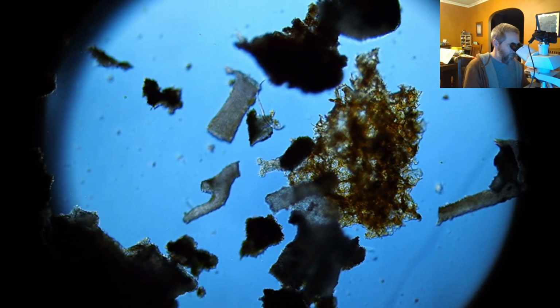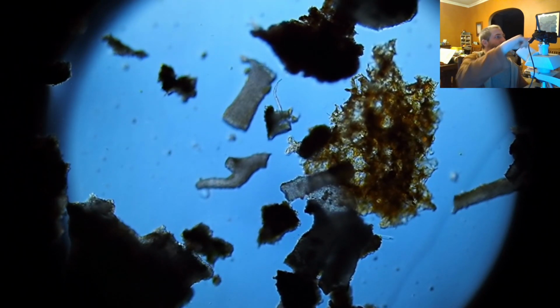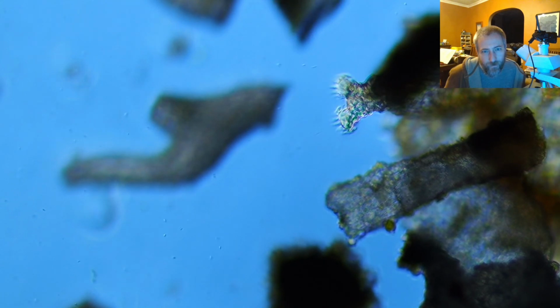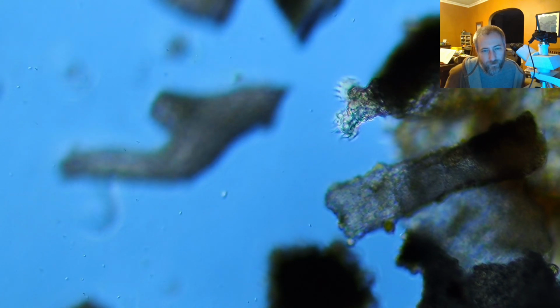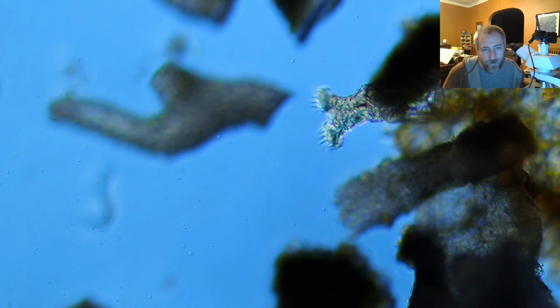Oh, there you can see it's got its corona out. Little cilia are spinning. Let me try to zoom in on that so you can get a good view of it, because those are really cool. You can see the little hairs associated with it. It can kind of pull them back inside of its mouth. You can get a really good view of it right there. So it's got these little tiny hairs around its mouth that it wiggles around. They look like they're spinning, but that's actually kind of an optical illusion. They're just waving around, and then you can see the particles being drawn towards its mouth as a result of that. So it's a really good look at that.